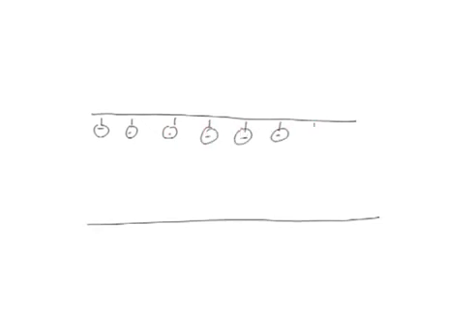You have a capillary, which could be fused silica or other capillaries. Now, like I said, above pH 3 these silanol groups are ionized and they carry a net negative charge. And of course, as you increase the pH, more groups will be charged. At pH 3 there is a smaller number of groups charged, but as you increase the pH, many more groups will be charged. So at the inner surface of the capillary wall, you have negative charge.